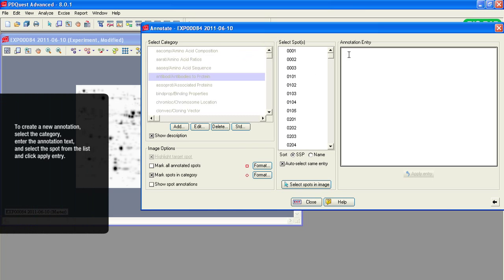To create a new annotation, select the category, enter the annotation text, and select the spot from the list.